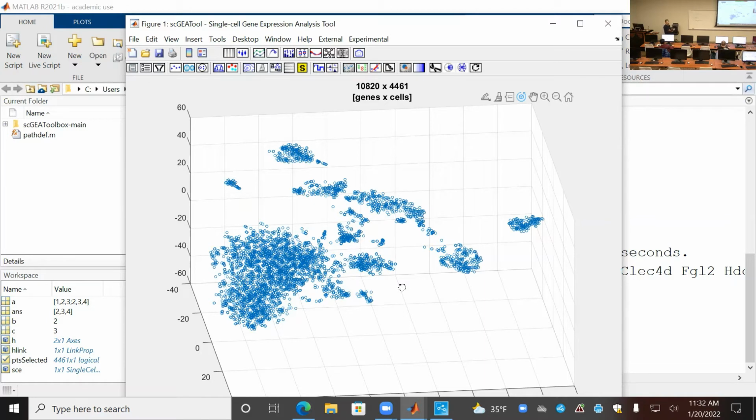And in stem cell development, you certainly can induce stemness of cells to make them become stem cells or develop back to mature cell types. Yeah, we do have those transcription factor cocktails to help you do this.